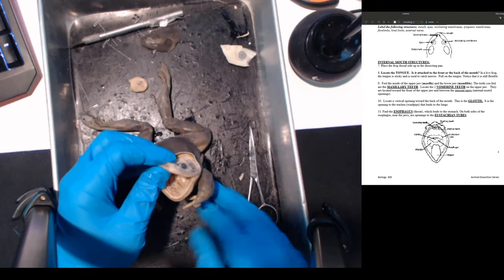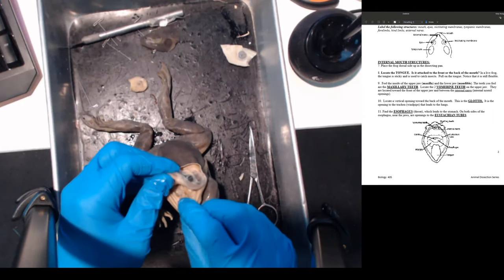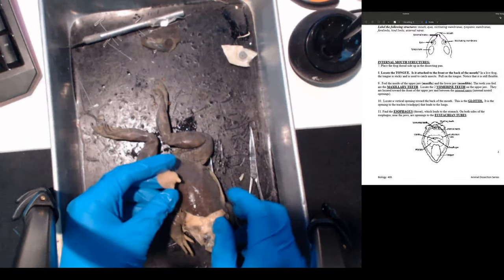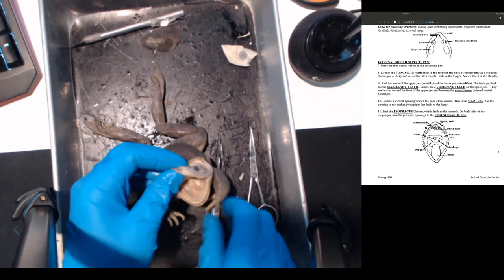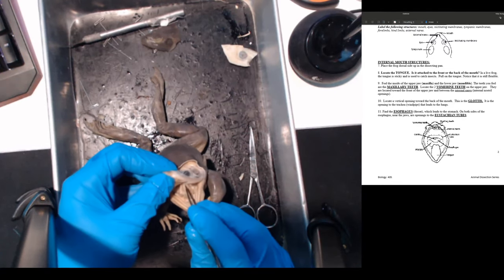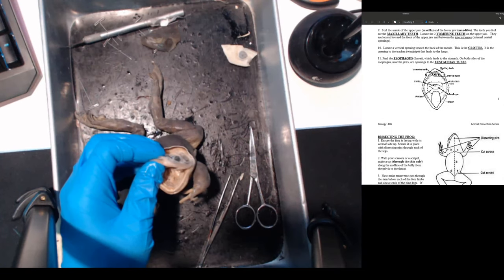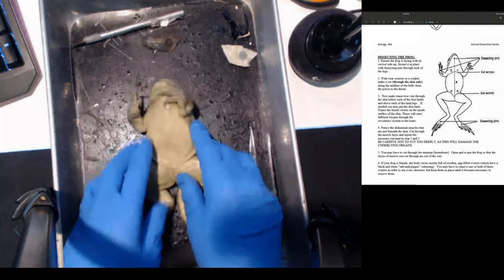I'm going to cut the tongue off because it's blocking the way. The tongue is off. At the back of the mouth right here - this is the opening that goes into your esophagus. When you swallow, that's where the food goes. Now let's cut open the frog and see what's inside.